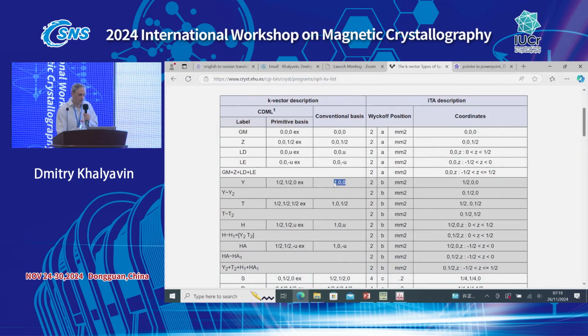So we go again to our Bilbao tool. As explained yesterday, Manuel explained very carefully that for a centered unit cell, K0 is not equivalent to, for instance, 100, because 100 is not a proper reciprocal translation.